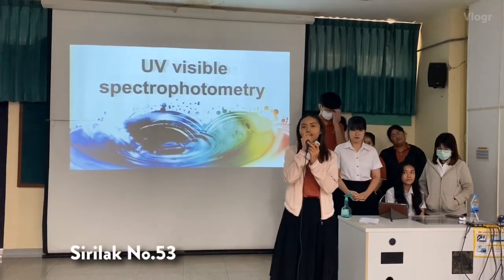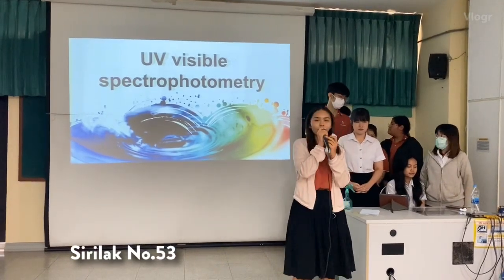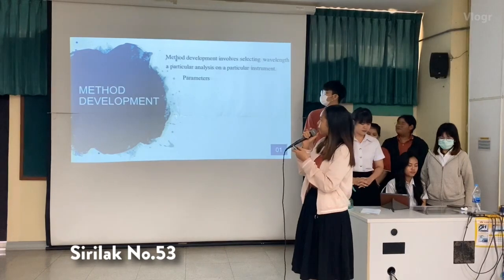Everyone, today we are talking about UV-visible spectrophotometry. Okay, the first topic is method development.